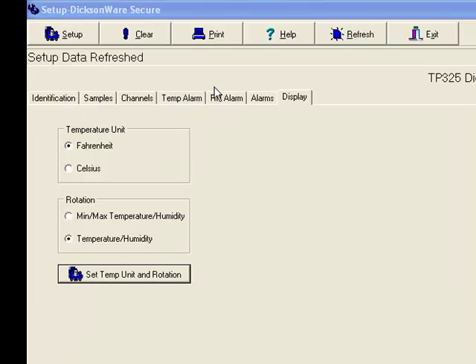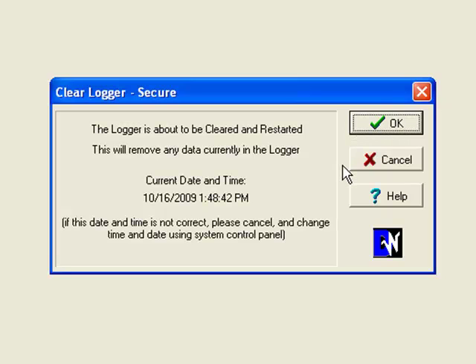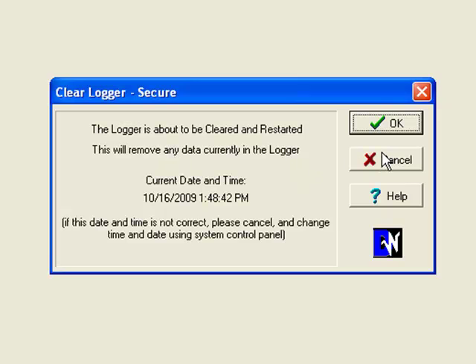On this unit, you can clear the data. I'm not going to, so I can have more examples to work with for later examples, but you just click OK. And you need to be aware that it is really clearing everything off, and it is not recoverable unless you have it backed up to an SD card. This model does not offer that, but many of our models do. I'm going to click Cancel.